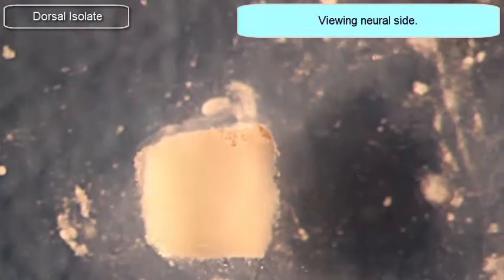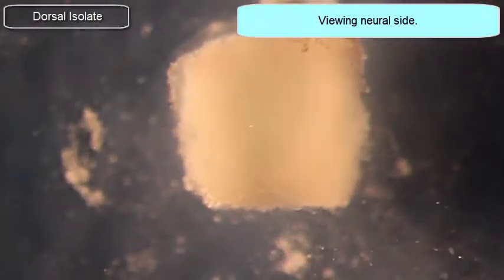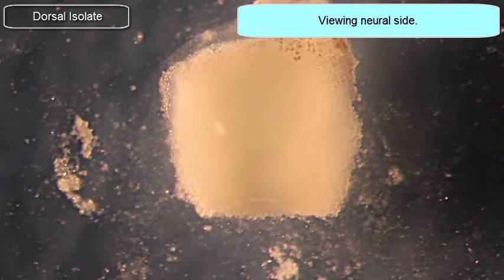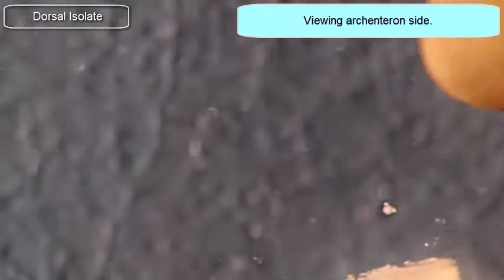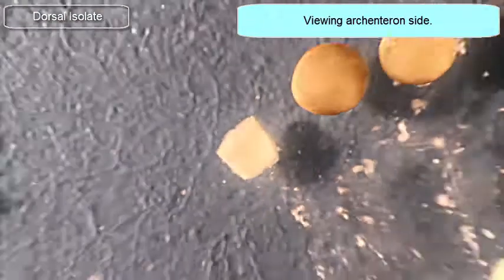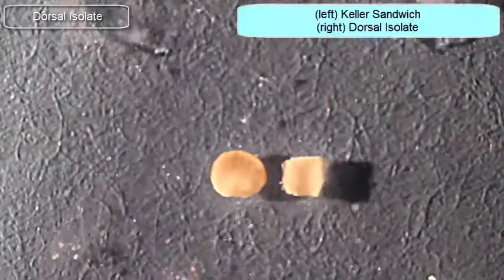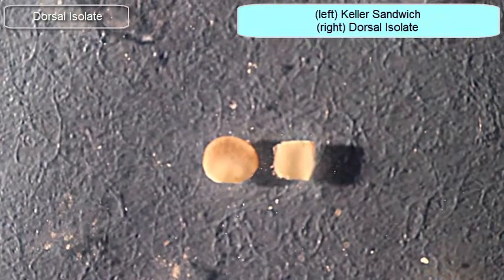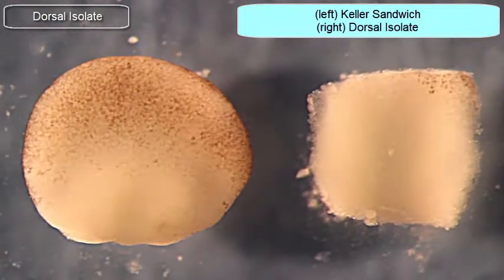It's a little bit off-center, but that's fine. I'm now looking at the neural side of this explant — the dorsal isolate. I'll flip it to look at the vegetal side, the archenteron, and the endoderm cells on the other side. For comparison, you can see the relative size of the dorsal isolate compared to the Keller sandwich — here with the Keller sandwich on the left and the dorsal isolate on the right.